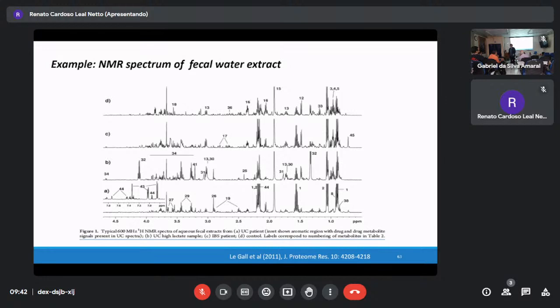I measured the NMR spectrum. Do you know what I found? Black mamba, king cobra, whatever, and tiny snakes. Of course protein is there, but I cannot distinguish what kind of compound it is. Citric acid, lemon. I thought the viper was a vegetarian, but actually it's not true.